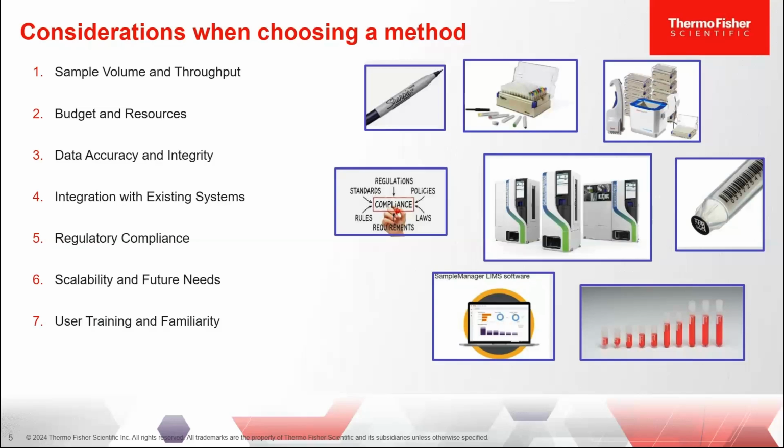Then you have regulatory compliance that you might want to consider as well. Labs should ensure that the chosen method meets their regulatory requirements and industry standards as well. Especially in regulated environments like clinical or pharmaceutical settings, this becomes very important.